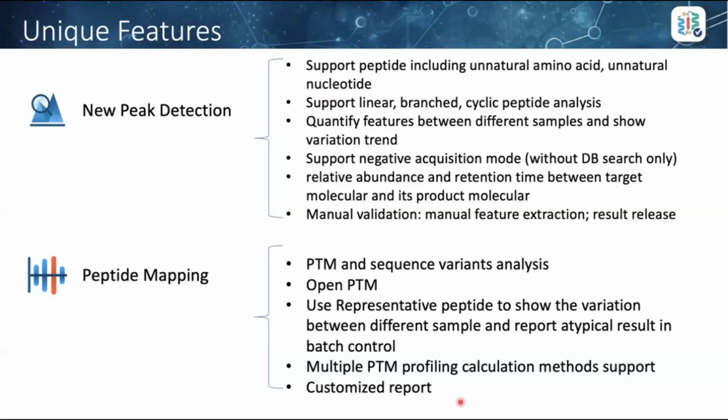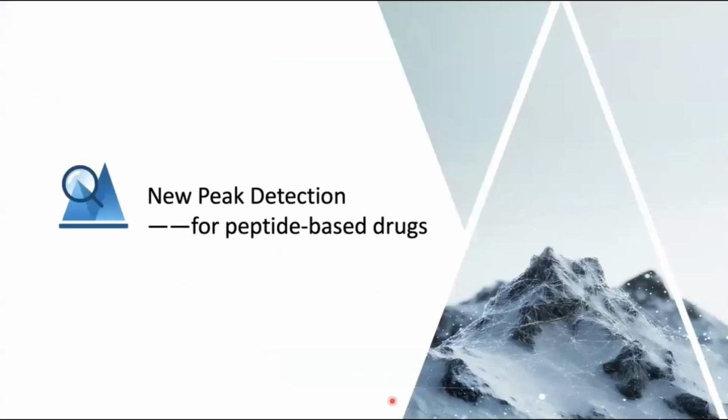In this function, we also provide different kinds of PTM profiling functions that can help you build your customized report. Considering the time, I will just pick one of those workflows to give you more detail. So let's go next to new peak detection.